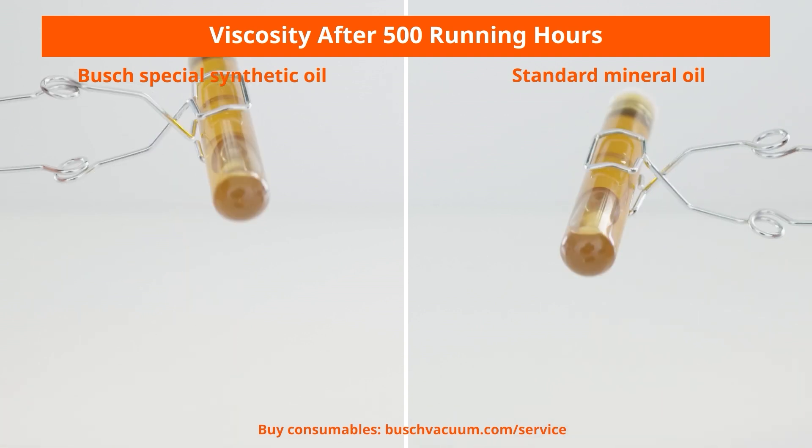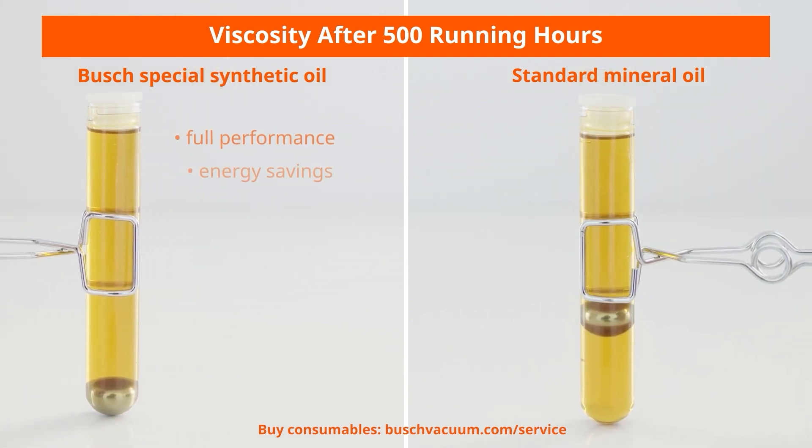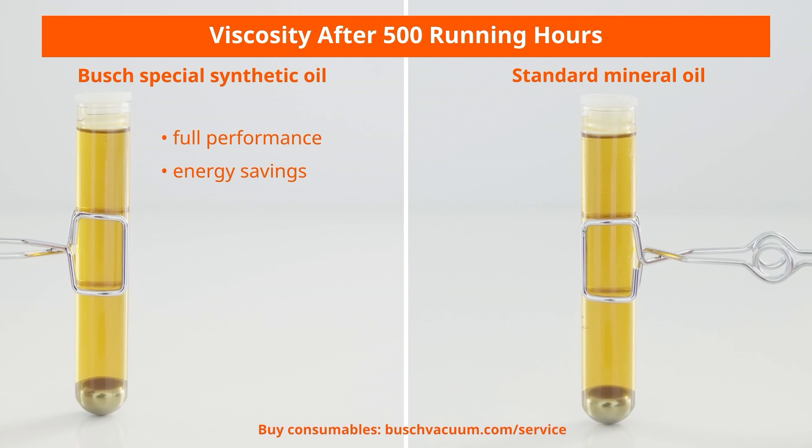We recommend to always use Busch genuine oils for the best performance of your vacuum pump. Even after 500 hours of operation, these special synthetic oils still retain their low viscosity, while standard mineral oils become very viscous. Their stable lubrication properties result in constant performance of your vacuum pump. In addition, the benefits of the high durability of Busch genuine oils are extended oil change intervals and lower energy consumption, as the vacuum pump is running more smoothly and under less load.